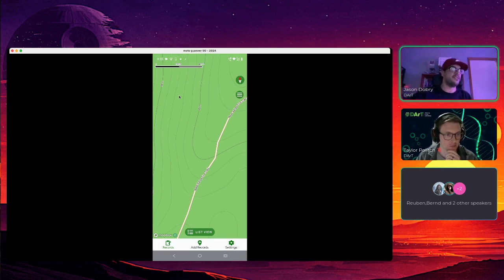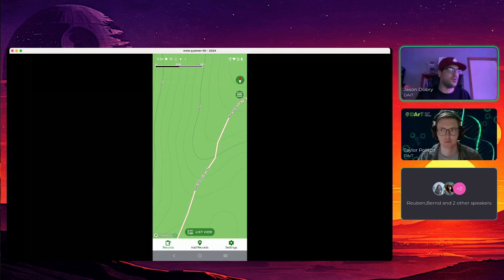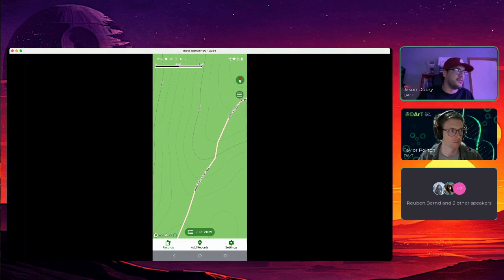And then you can do all the analysis from there using all the other tools that we have, DS14 and dartR. So I'm going to pass that back to Taylor so he can show you how it works with the web app once you've uploaded the data.